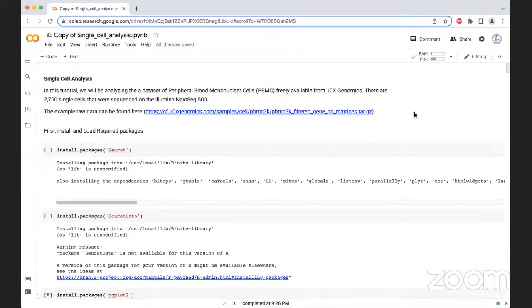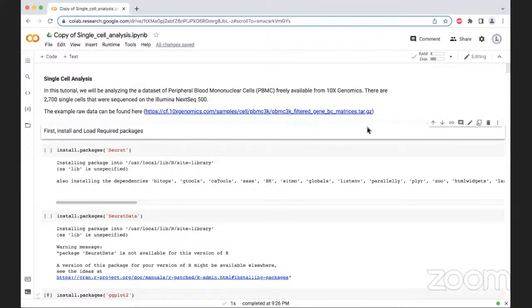So we are going to do everything, and also we can do much more with the curated libraries and packages using this Colab, or you can also install the same in your R Studio, which is recommended because this can take a lot of time to perform.